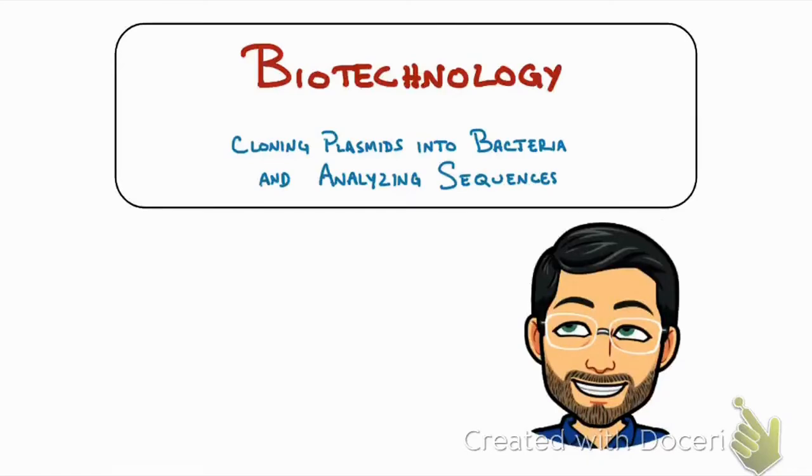Hey all, this is the second video in our series on biotechnology. In the first video, we talked about how to create a cloning plasmid, or how to put a gene from, for example, human cells into a plasmid that we would eventually express in bacterial cells. In this video, we're going to talk about how we actually get that plasmid into bacterial cells, and then we'll talk about how we determine that we've actually successfully cloned the gene that we want to. So we'll talk a little bit about sequencing techniques.